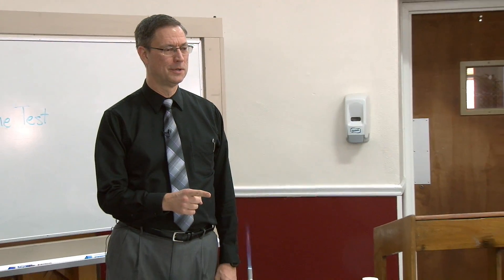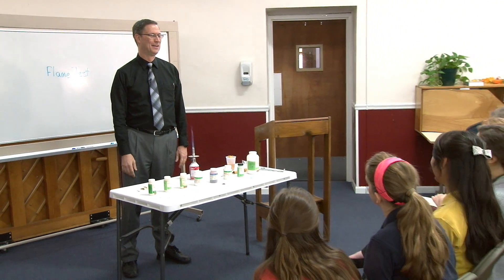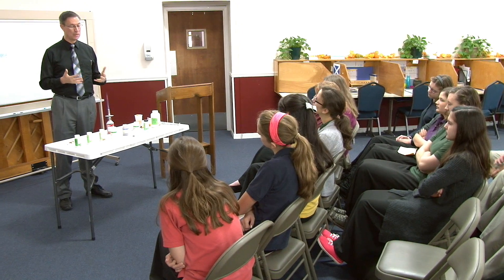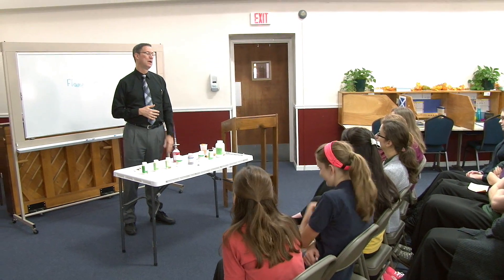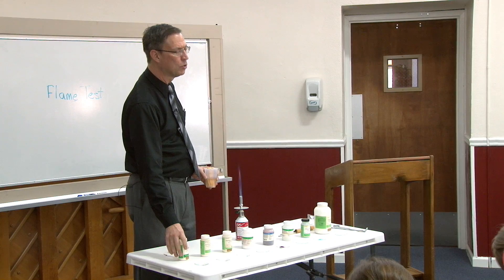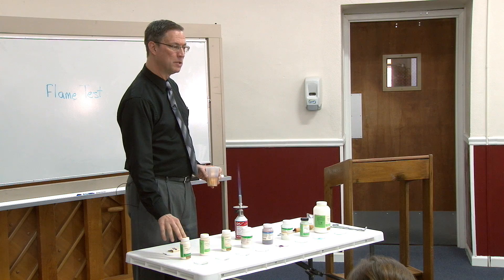This is the flame test. In one of your physical science paces — I think it's 1113 — it talks about the various elements and explains that each element gives off a unique color when it's put into a flame. This is a butane burner, and I have different elements in here. These all have chloride with them as well, but chlorine is colorless. So this first one is lithium chloride — the lithium is the one that will give off the color.